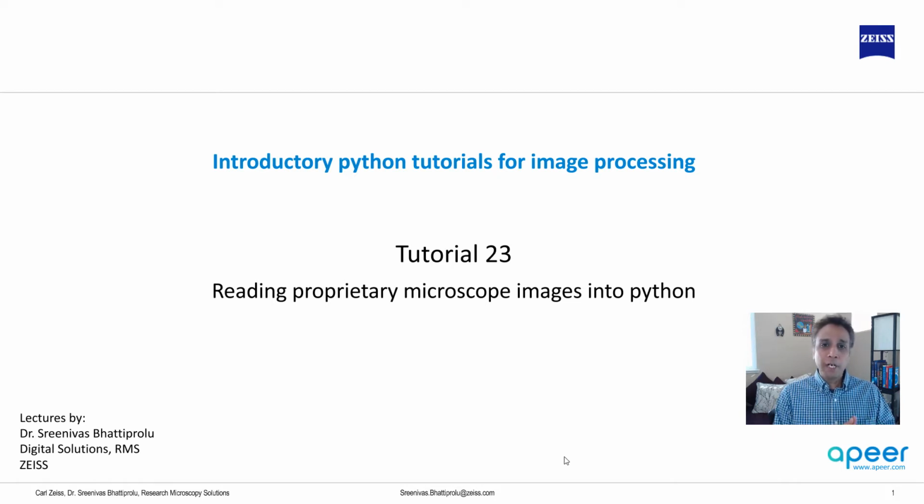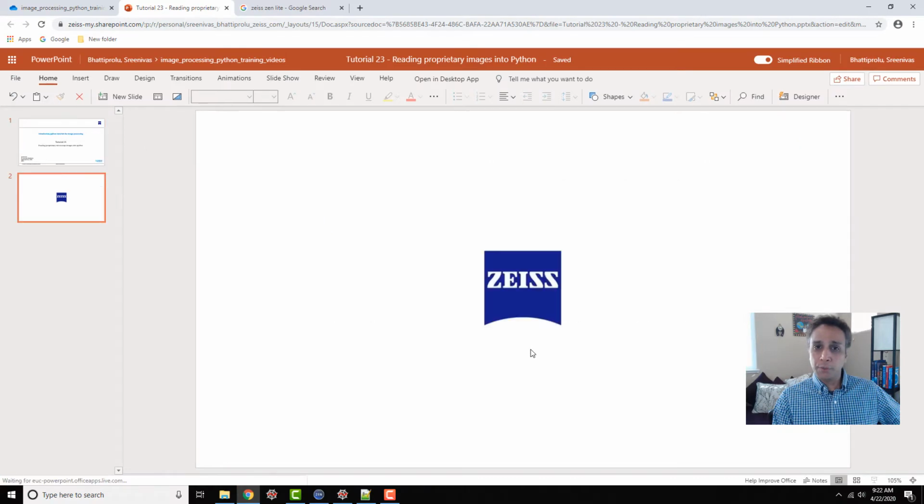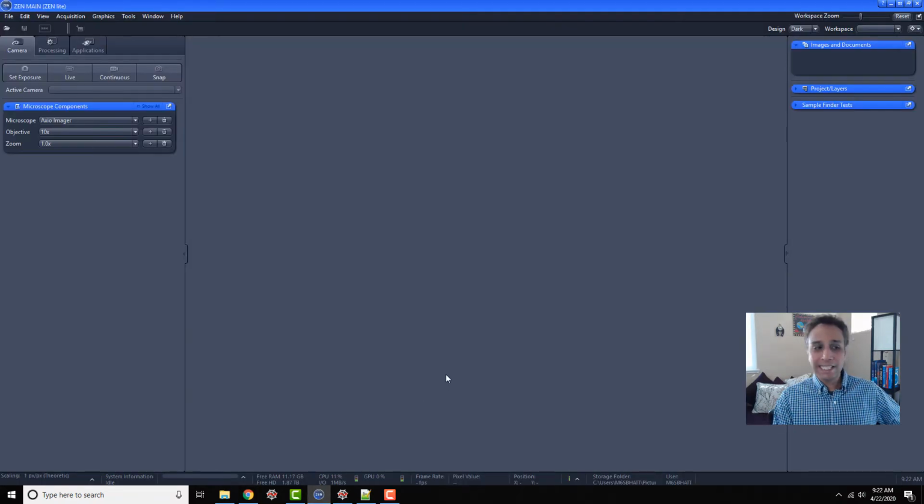But most microscope vendors or third-party software providers try to use different extensions or different file formats to contain these images, or to display or to store your images. And there's a good reason for doing that, because these special formats allow maximum flexibility to play with the data during acquisition and post-processing. So for example, if you work with Zeiss microscopes, you're collecting images in .CZI formats.